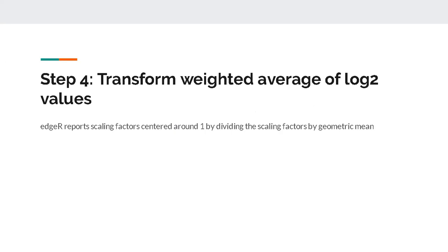And once you get that scaling factor, all you have to do is just, whatever read counts you had gotten, bump your so-called apparent read count up or down depending on what your sample is. So if there are more highly expressed genes being expressed in a particular sample, the scaling factor would be low for that, just to bring the effect of highly expressed genes down.